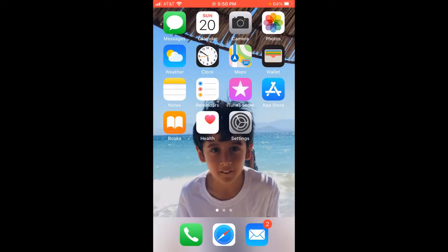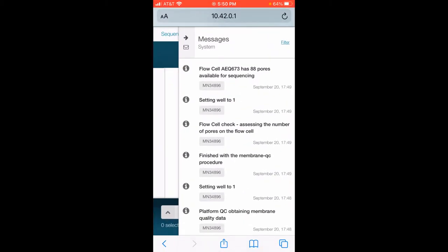It turned out that I clicked on the messages and it says it has 88 pores that are available for sequencing. It also said that it didn't meet the temperature but it went ahead and went through with the process. So we've got 88 pores at this step and the flow cell is ready to go.